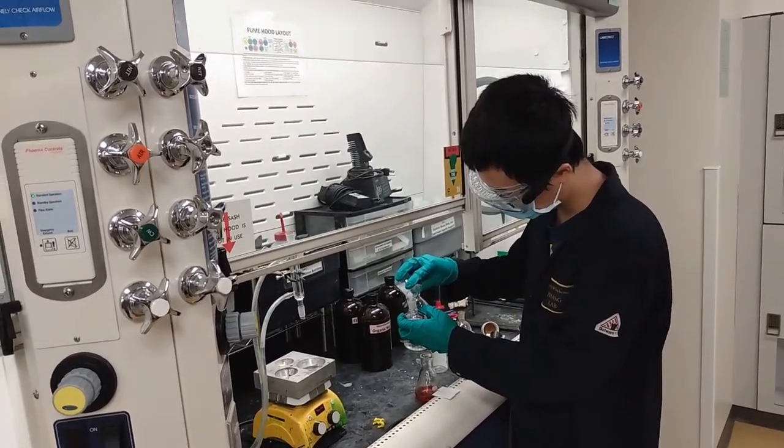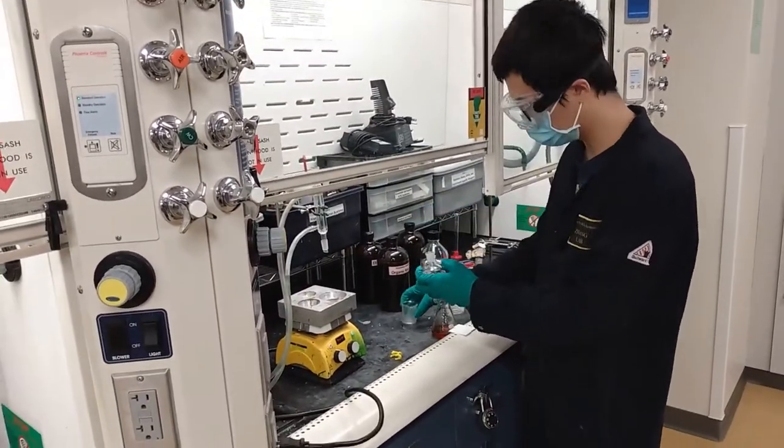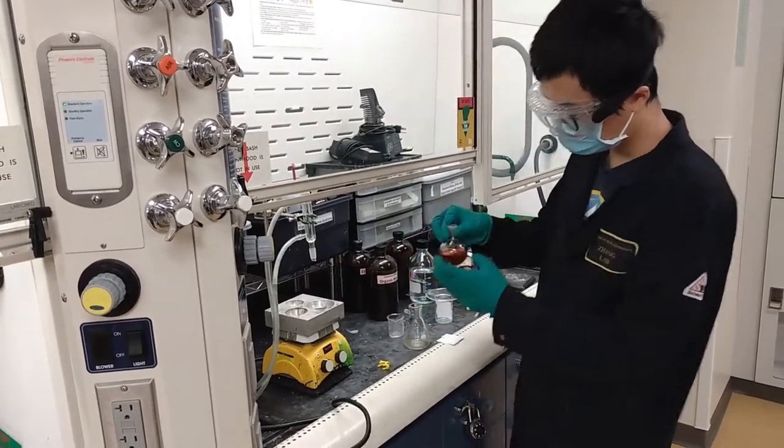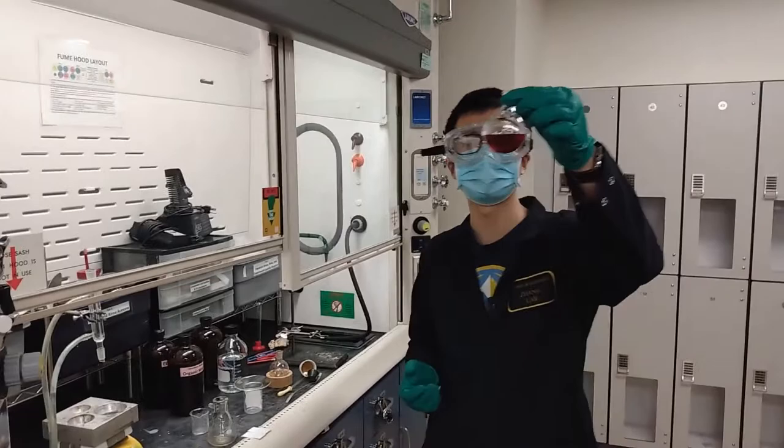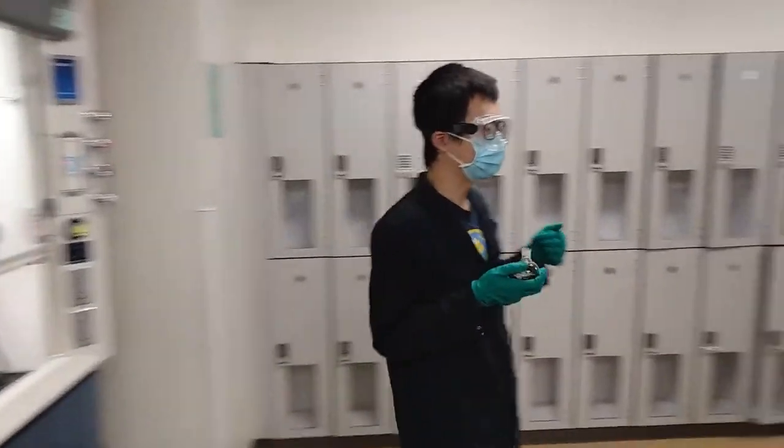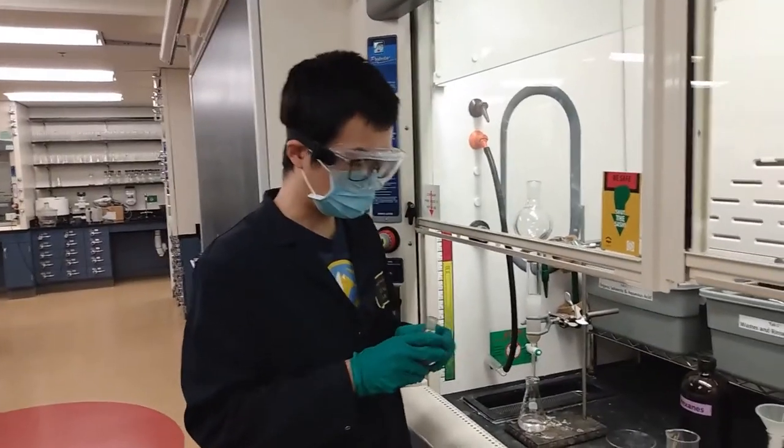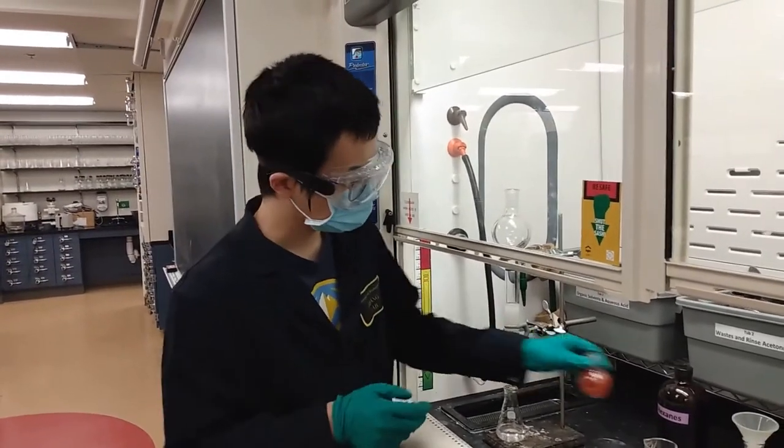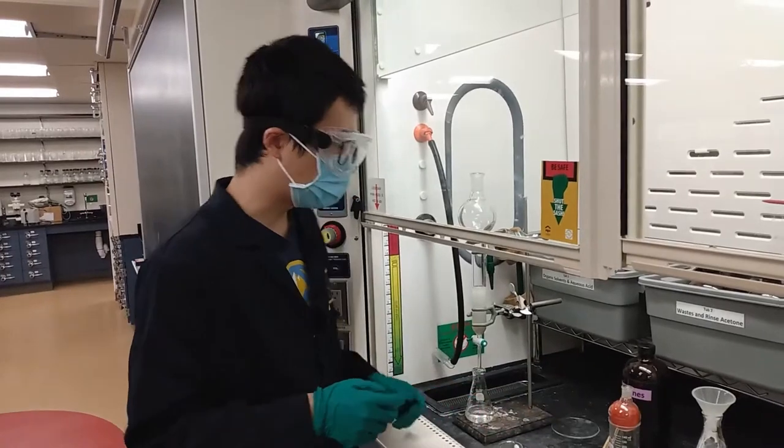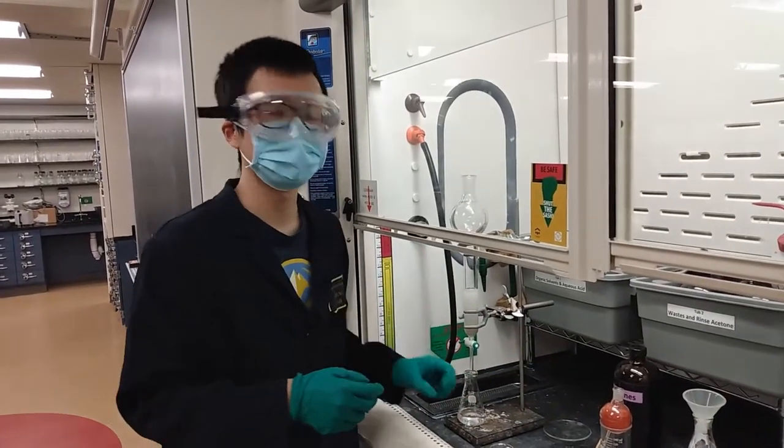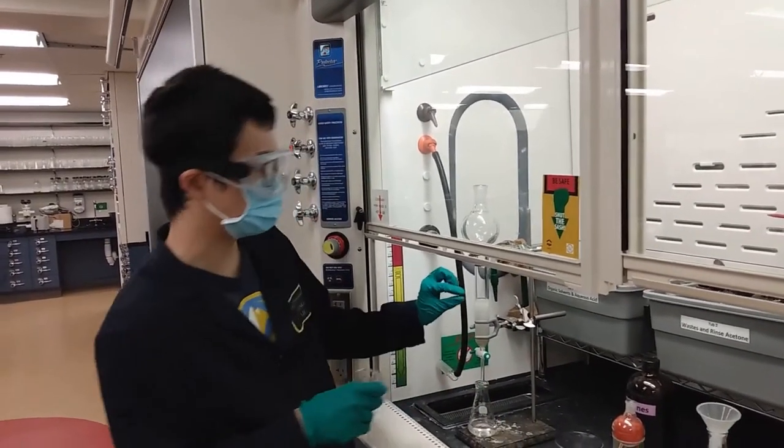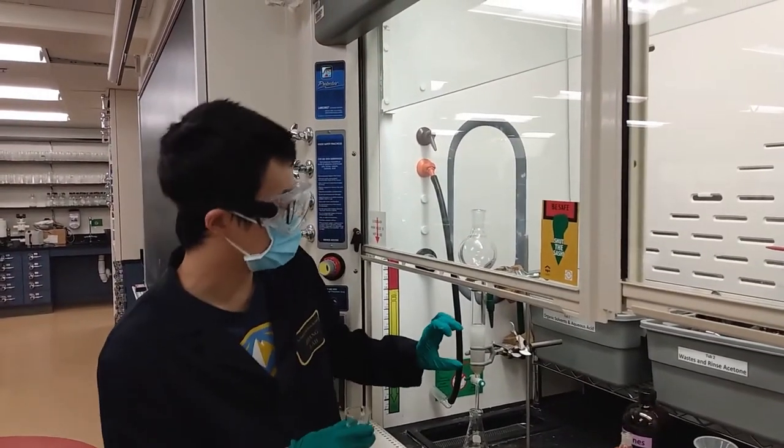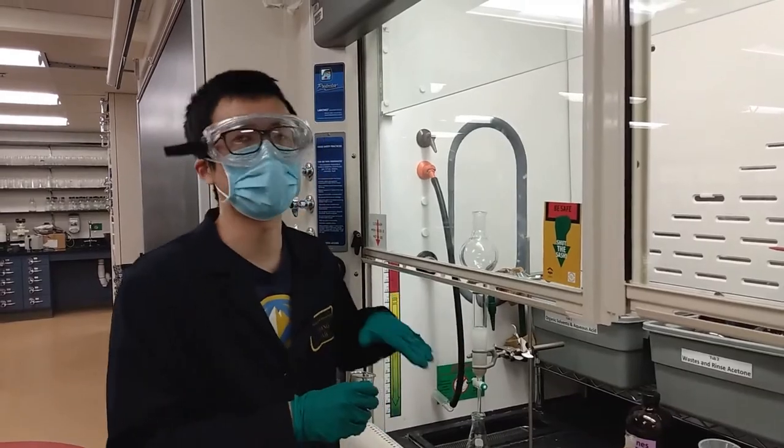Before we load it to the column, we need to add a little bit of sand on top so we can load our sample to the column on top of the sand, just to keep the silica gel in the column packed.